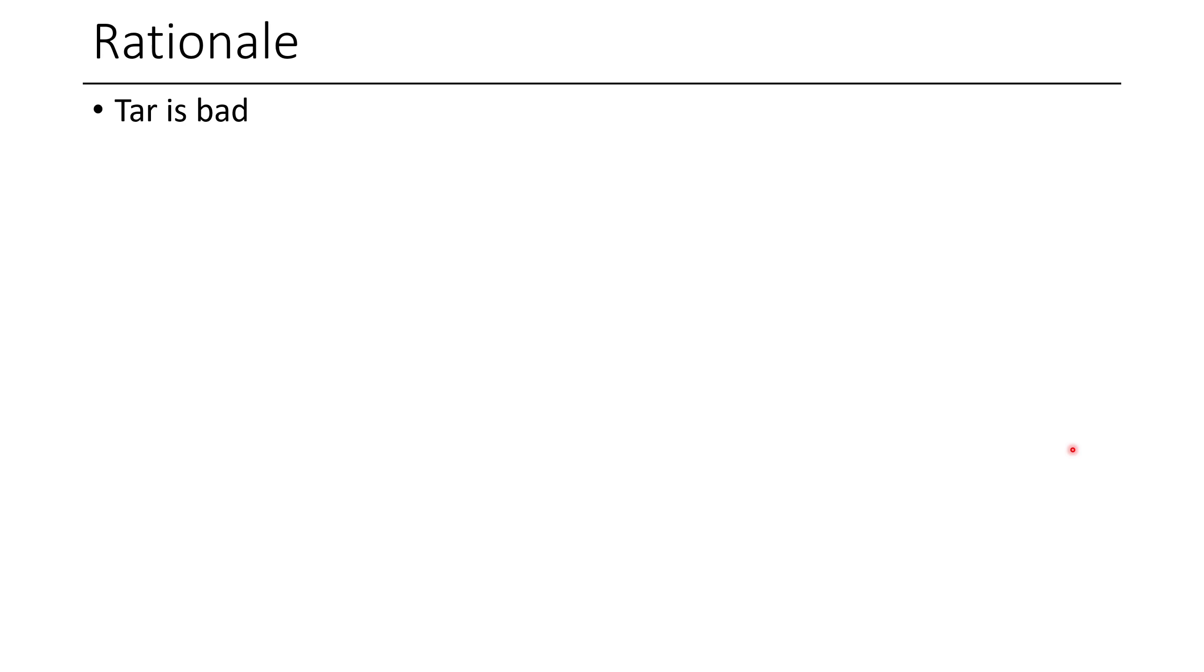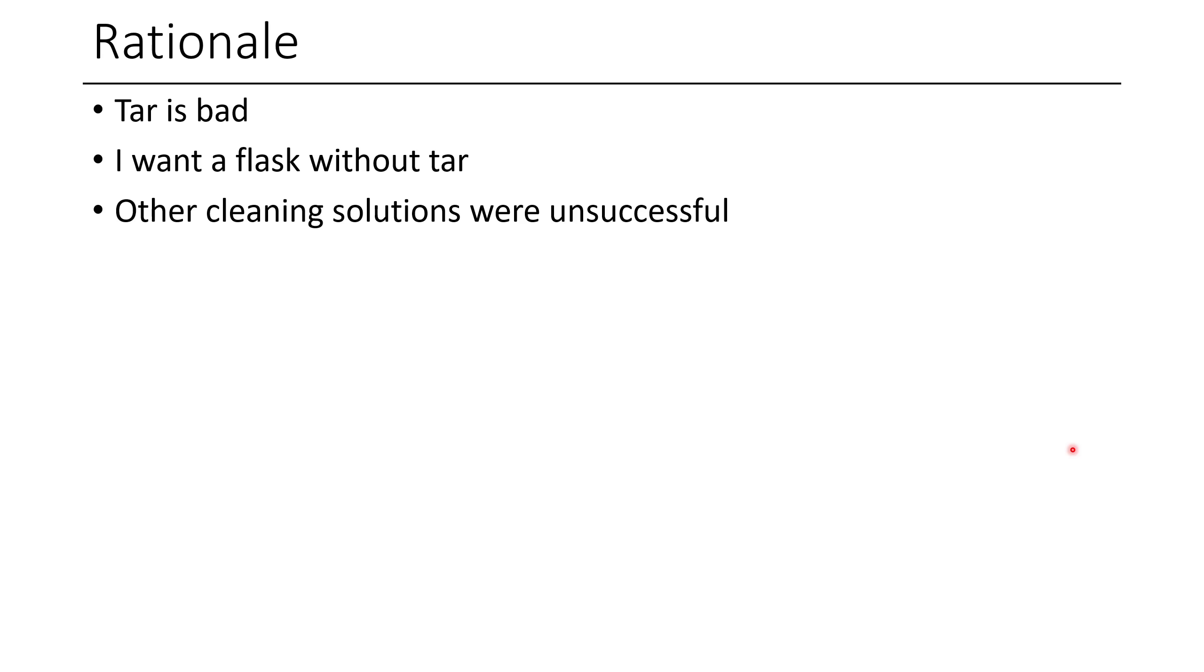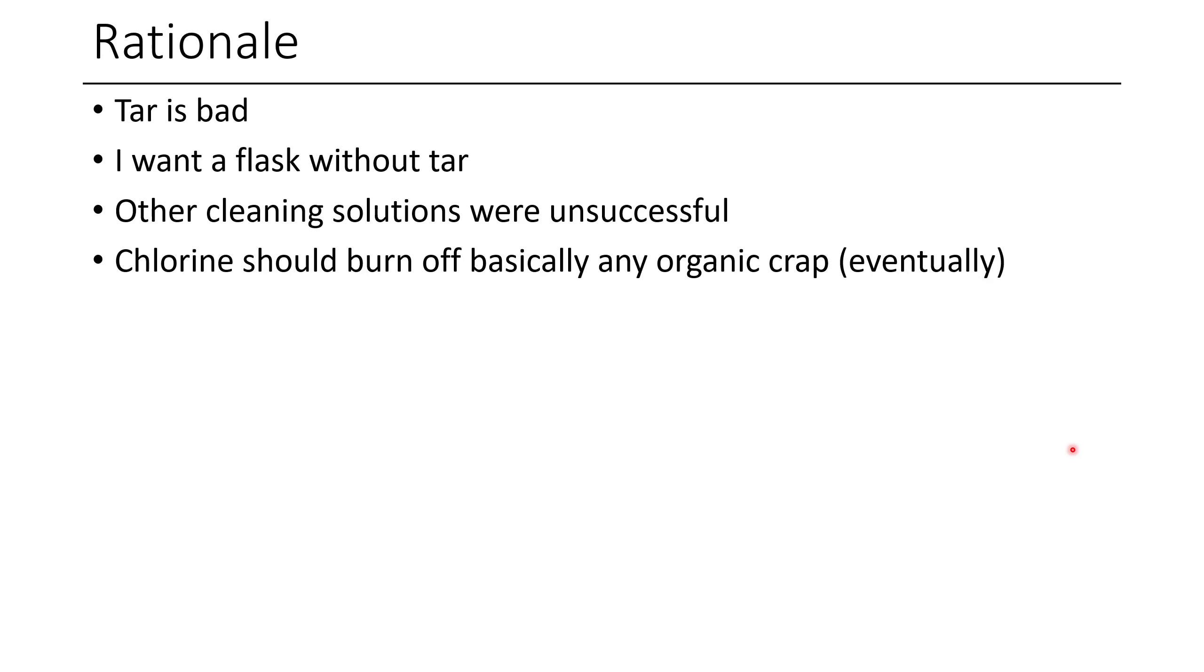So the rationale here is you have tar in a flask. Tar is bad. You want a flask without tar, because if you're going to do chemistry in a flask, that better be a tarless flask. And so when I had tried cleaning out a flask, in my case, I wasn't able to use any of those other solutions effectively. I tried a lot of solvents. Occasionally, all I would get is a little bit of white tar as a crust on my other tar, but it didn't really work.